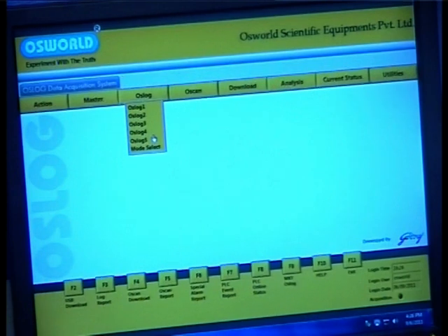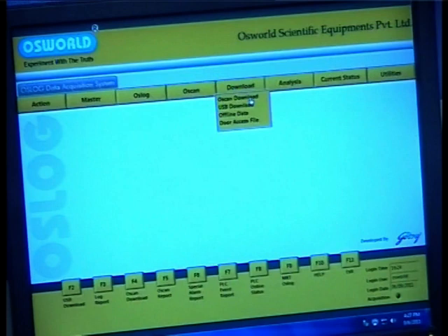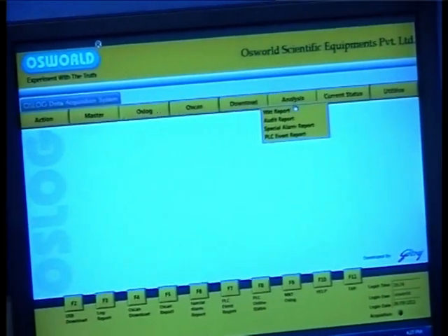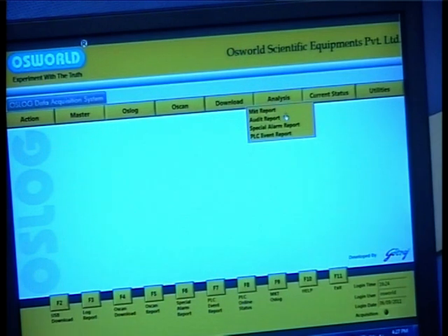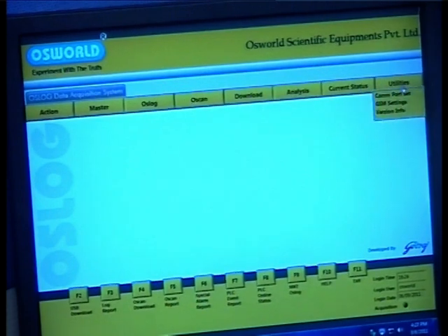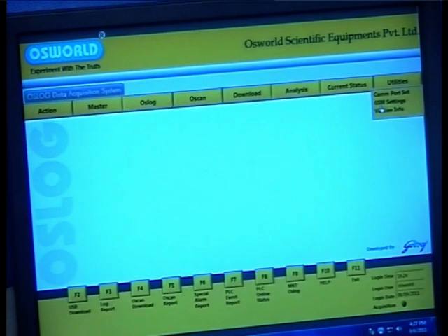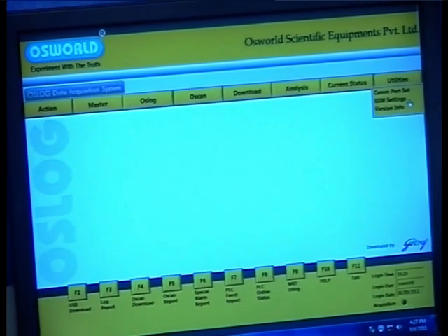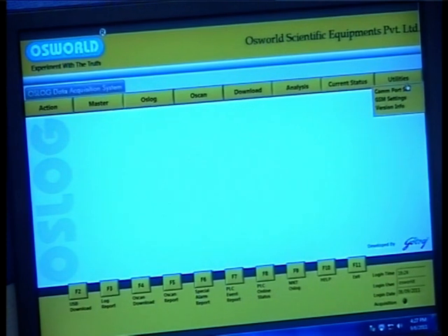The download drop-down displays a number of tabs used for the data download process — I will explain the details of some of them shortly. The tabs under the analysis drop-down are used for generation of reports, which can be downloaded as numerical or graphical reports depending on your requirement. Under the utilities drop-down, observe a tab called GSM settings. Once configured, this option enables one or multiple users to receive an SMS alert on their mobile phone in case of certain changes within the chamber, such as a temperature rise or failure of equipment.